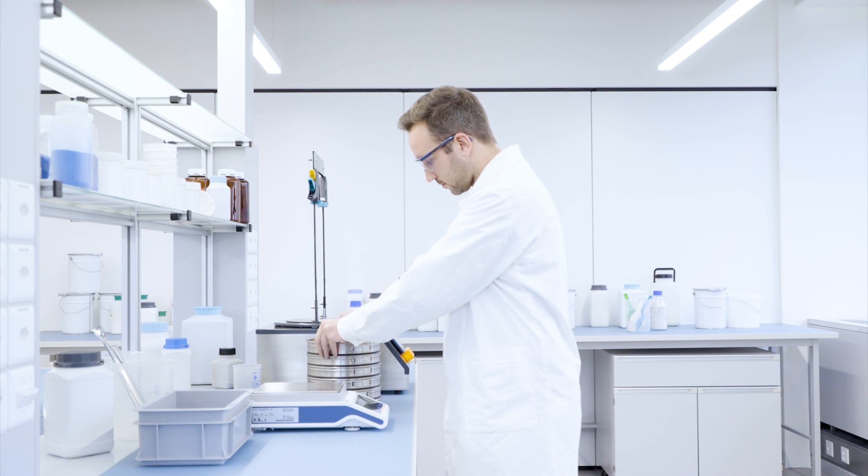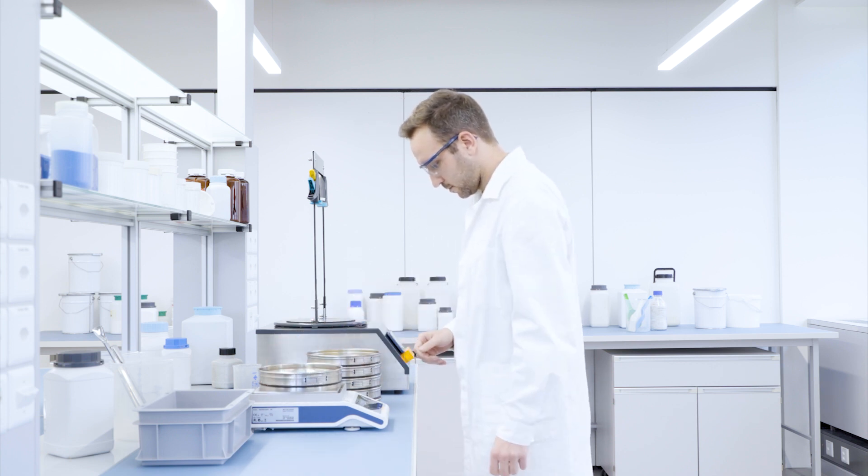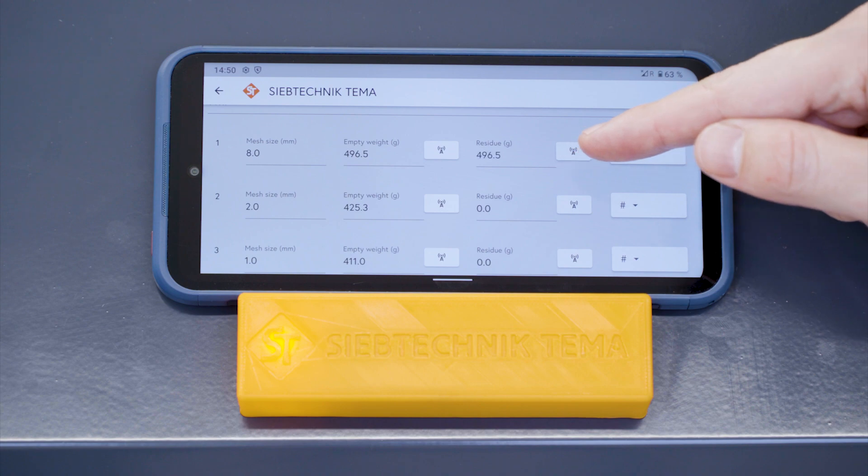Sieves with their respective particle fractions are back-weighed in reverse order on the scale. Results are easily transferred and stored.